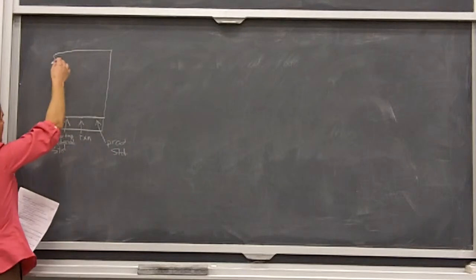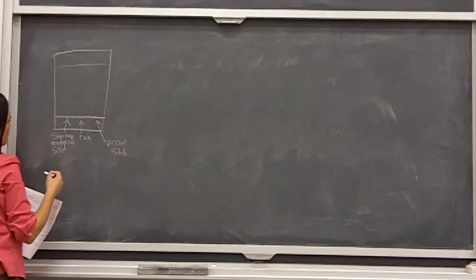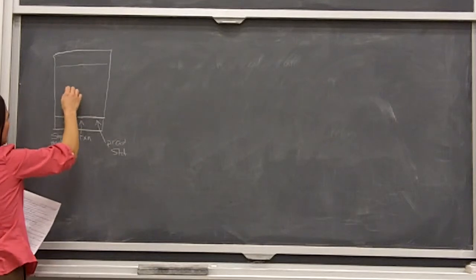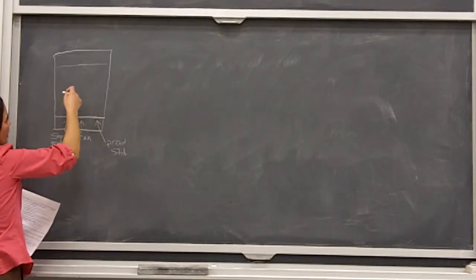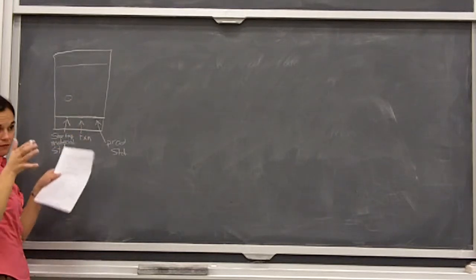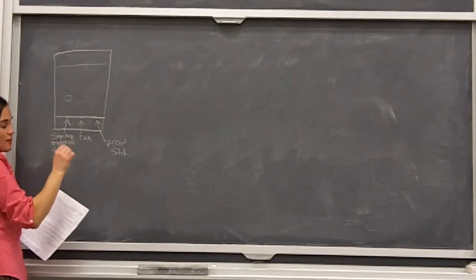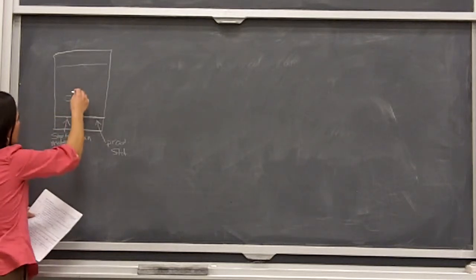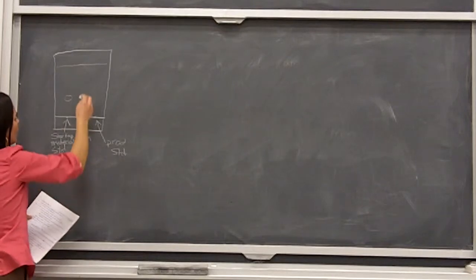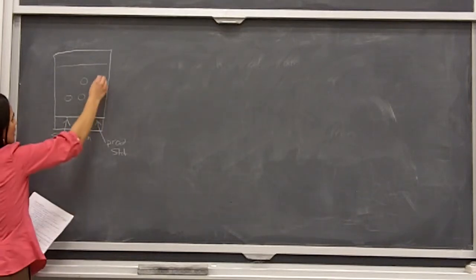So we developed this TLC plate. We know where the eluent went to as soon as we pull it out of the chamber. Say we've got our starting material. And this is not necessarily the way it's going to work out for you, okay? So I'm just using this as an example. I'm not telling you this is what your TLC plate should look like. Say we've got a starting material here. We've got a reaction that looks like this.